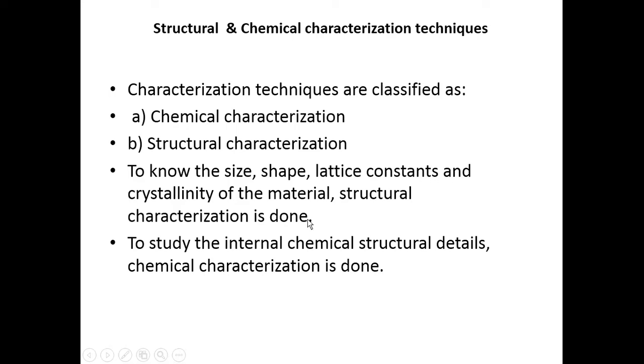This is done at atomic level because the material surface, films or nanoparticles are at atomic level, with a very minute particle structure or lattice structure.